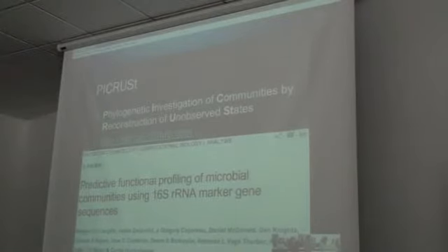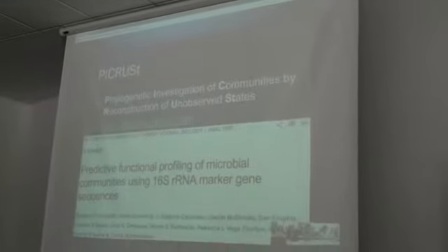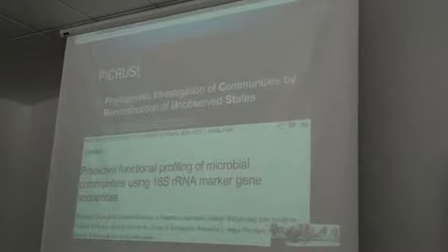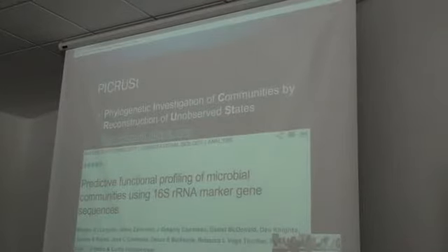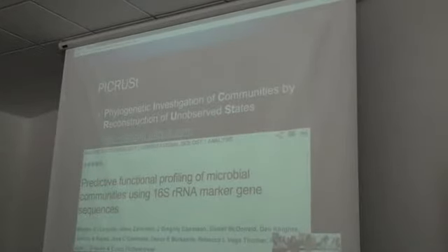So for PICRUSt, PICRUSt stands for Phylogenetic Investigation of Communities by Reconstruction of Unobserved States. Here's the URL. And I'm just one of many authors on the paper. So myself and Jesse were the two lead authors on it, but it involved quite a few other people just to bring together the package in a reasonable format.